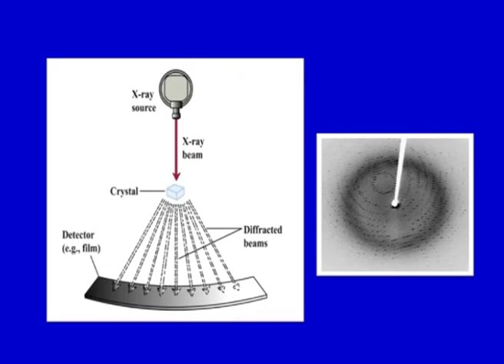They also make it convenient to tune the wavelength of the radiation in a synchrotron facility, which is useful for the multiwavelength anomalous dispersion method of phasing. Synchrotrons are generally national facilities, and there are dedicated beam lines for collection of the data. So, if you summarize, there is an X-ray source, the crystal mounted in a loop, and it is irradiated; the crystal diffracts as per its packing and other parameters.